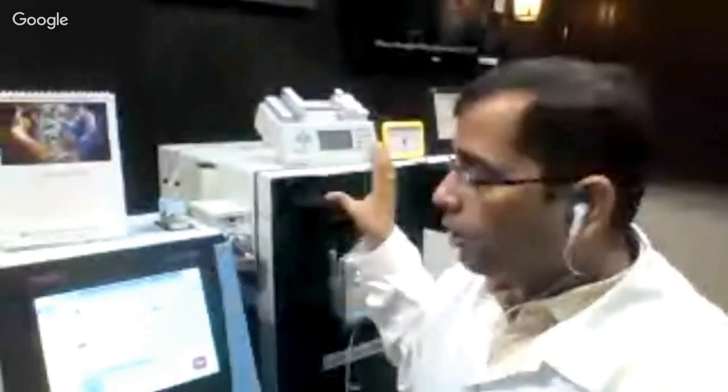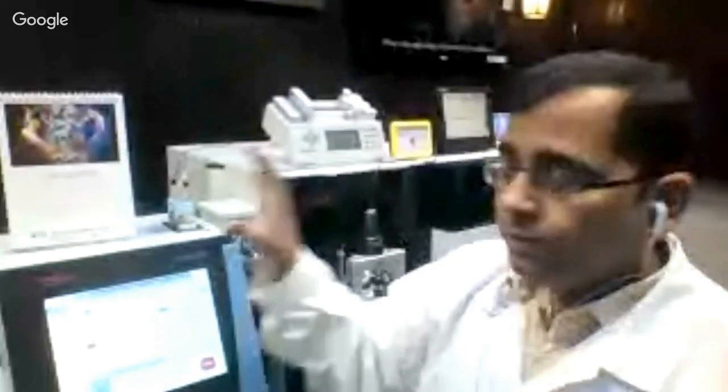This just gives you a first-hand perspective of what the latest technologies are, and how we are able to use them for actual research work.